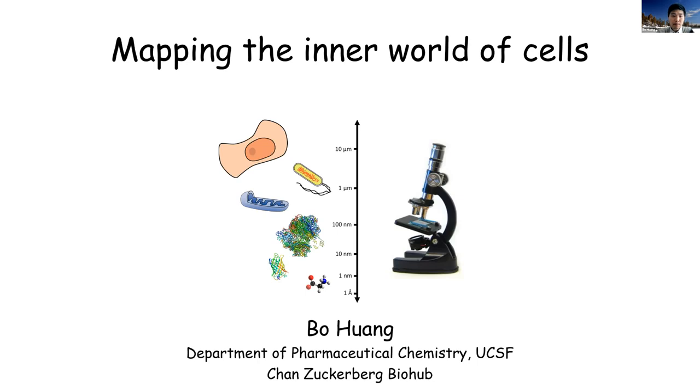The Human Protein Atlas by Emma Lundberg is focusing on antibody staining. That is a different scenario compared to live imaging. A more interesting comparison is the work by the Allen Institute and OpenCell.